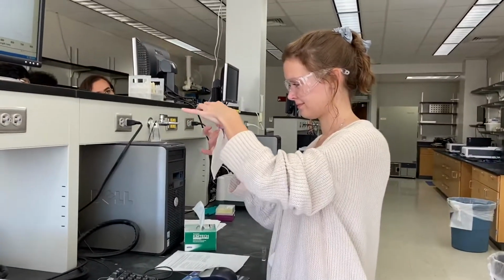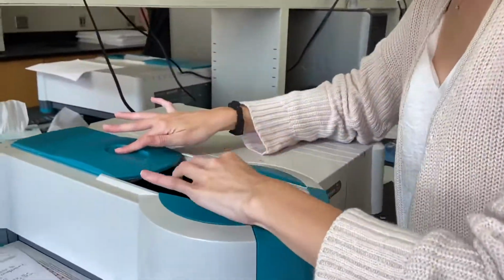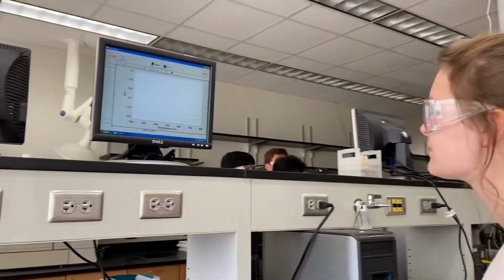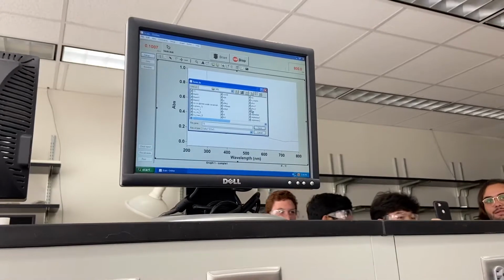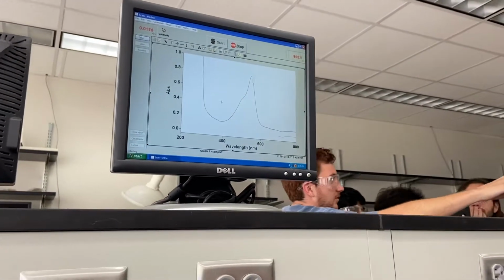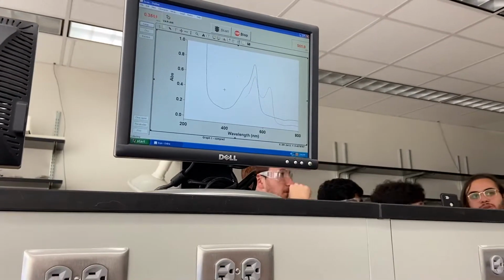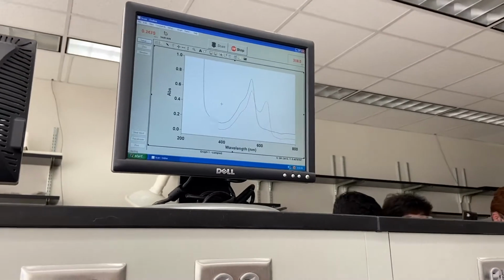To scan a sample across all wavelengths in a spectra, place the cuvette with your diluted sample in the spectrometer, hit Start, give your sample a name, and hit Save and then OK. You will then be given a graph of your sample's absorbance as previously mentioned. However, we could not assume purity for our second sample, which produced an absorbance graph with 2 lambda maxes. This meant that the sample contained 2 dyes and therefore was not pure.